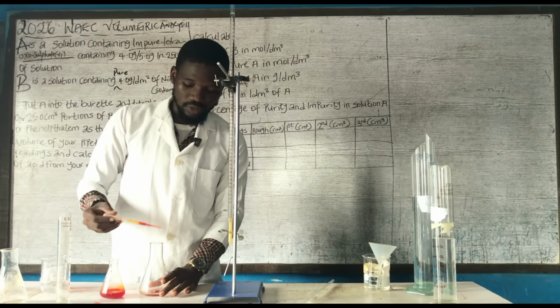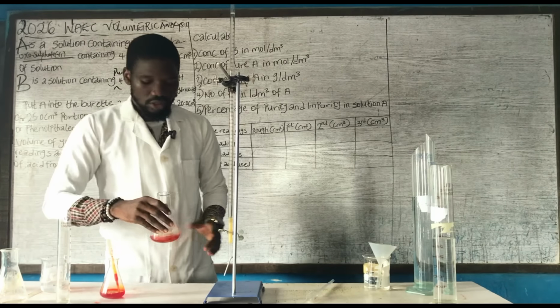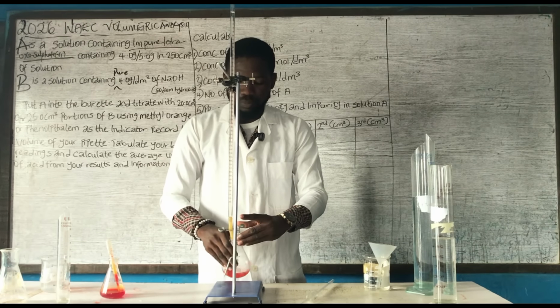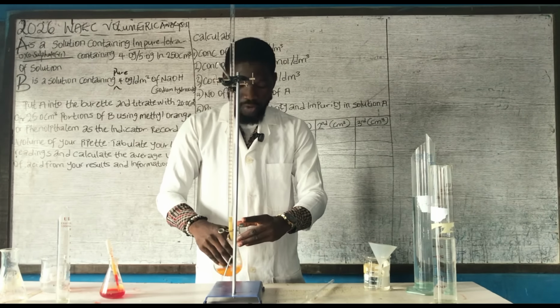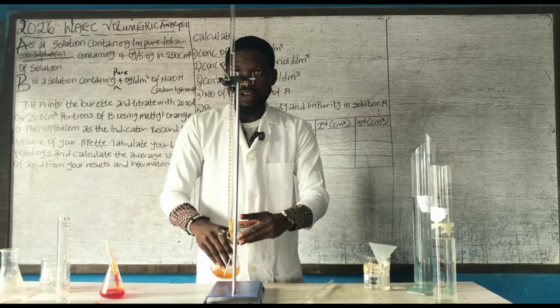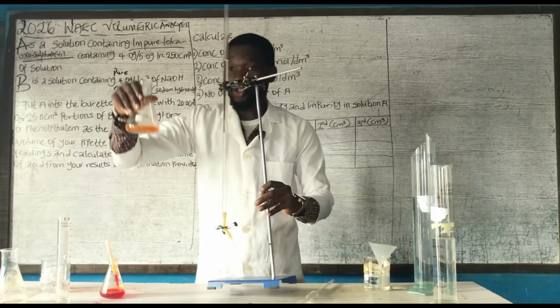The first one. Also have another one. So the moment we have this, take it to this place. So you release until, if you can see, we have a change in coloration. Are you seeing it now? Guys, what do you have here? The color is orange.